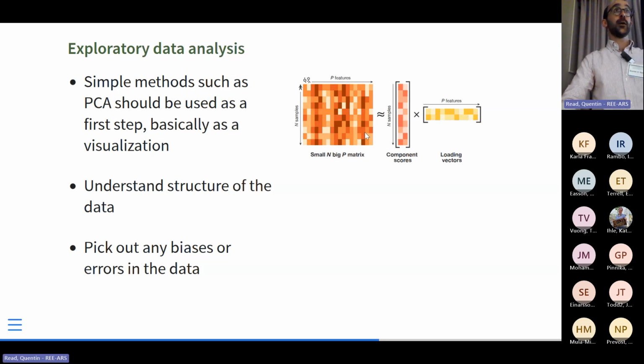That's how many. So if you had 1,000 variables in your omics data set, it would be 1,000 long, and that's like the loading of each of your genes or metabolites on those dimensions. It explains how much each of those raw data variables is contributing to the reduced one that we got.